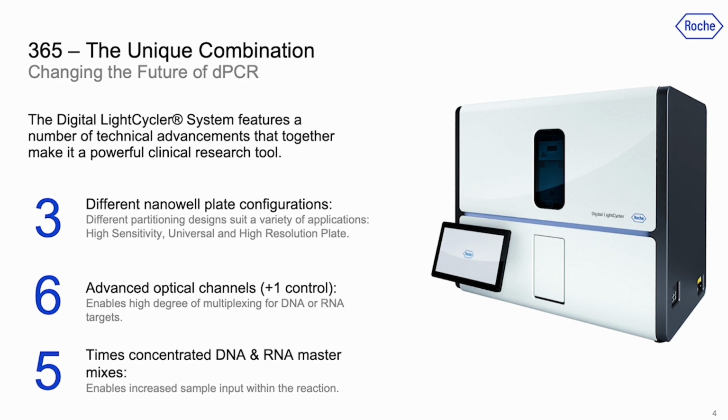Additionally, there are 6 advanced optical channels, but there's also an additional channel which does not allow for content, but is utilized for detection of partitions that are filled with a fill control that is located in the 5x master mixes, which you can imagine is very important, right?